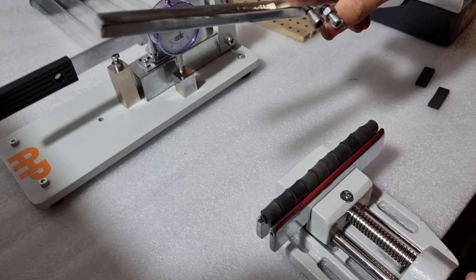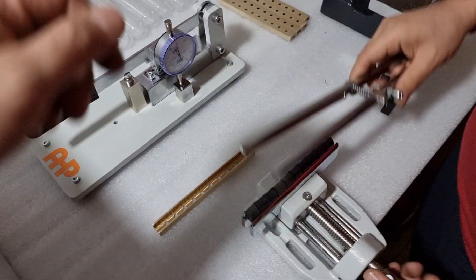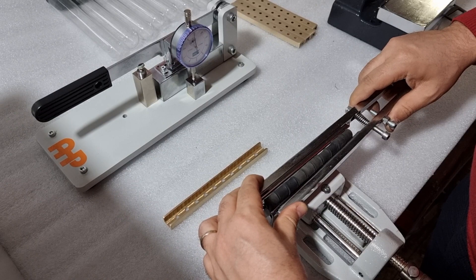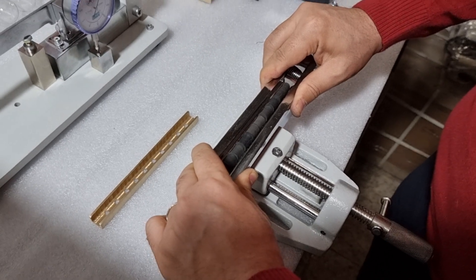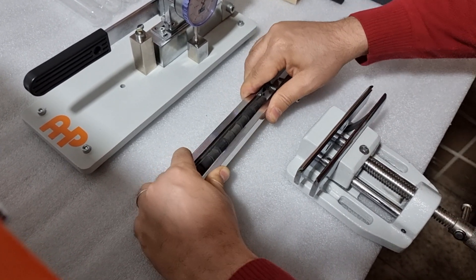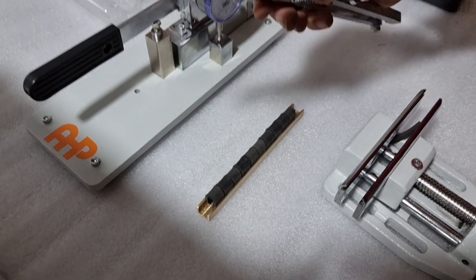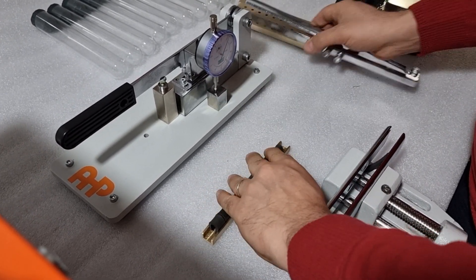For 10 pieces of samples, place them inside the bending tool and bend all samples using this bending tool. Then using this breaker, you can remove all these samples together and put them inside. Using this transfer tool, you transfer all 10 sample pieces.